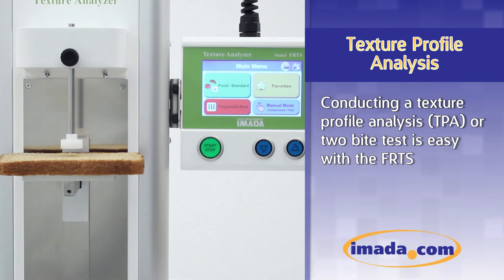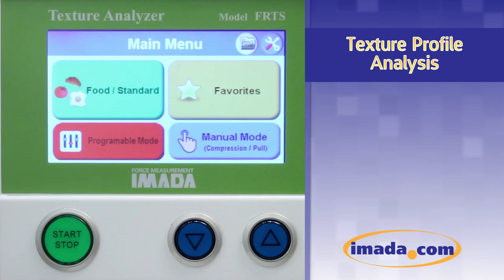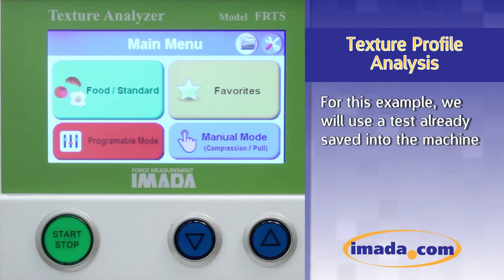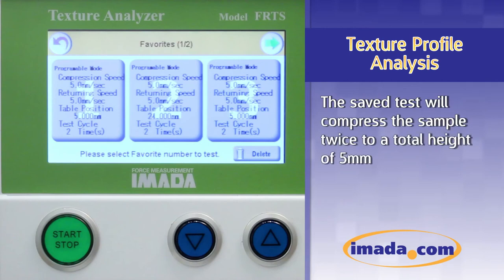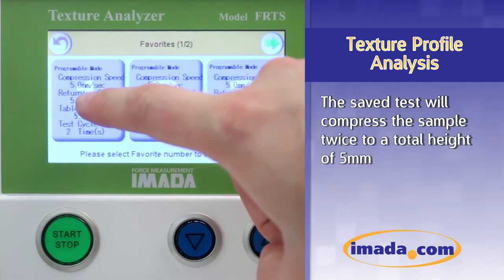Conducting a texture profile analysis or two-cycle test is easy with the FRTS. For this example, we will use a test already saved into the machine. The saved test will compress the sample twice to a total height of 5 millimeters.